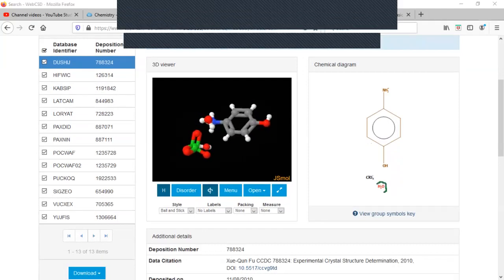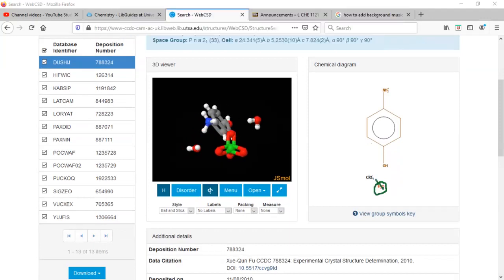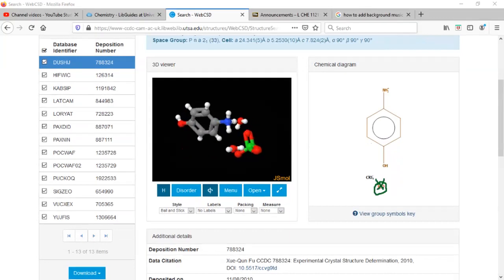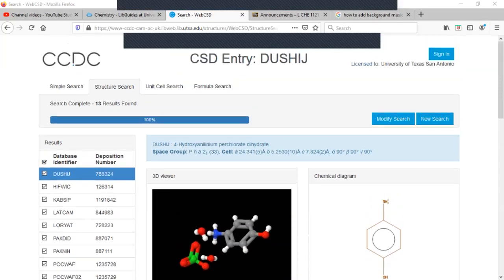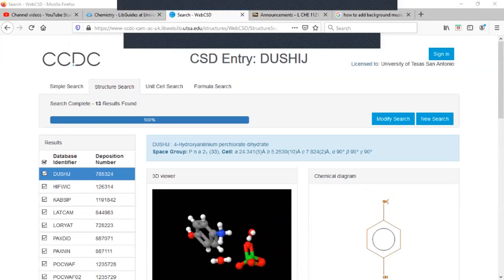in addition to the para-aminophenol cation and anion, you have water. So this one would not work. So you need to scroll through, I believe it's 13 hits, and see which one just contains the protonated version of para-aminophenol and the anion that was in your question.